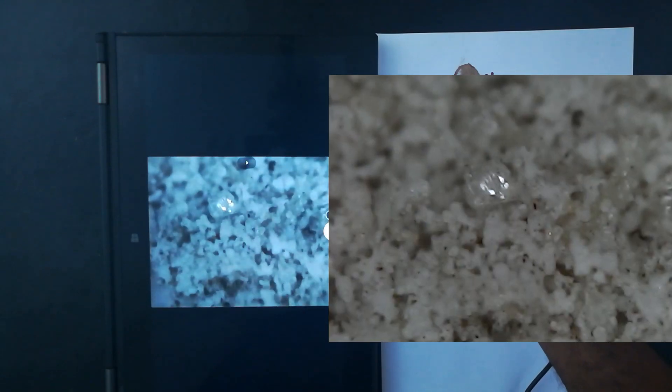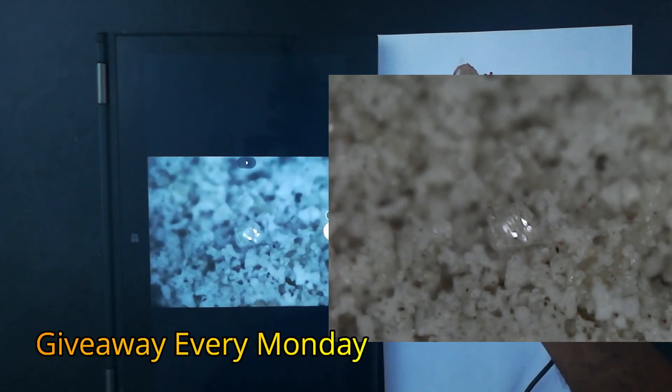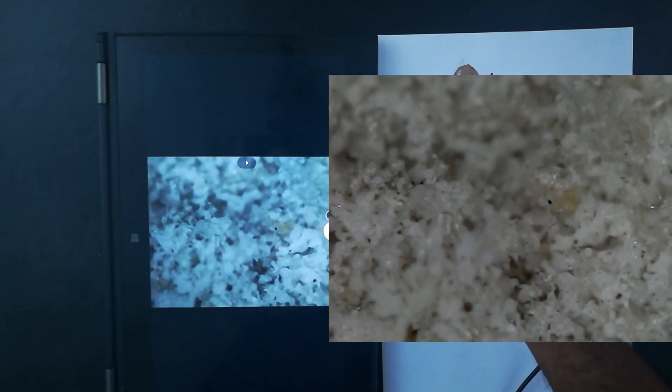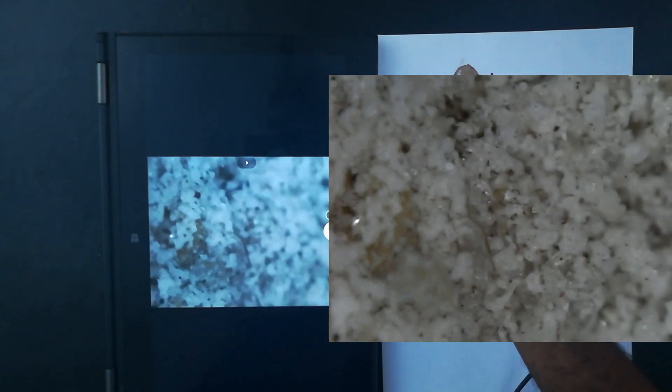These are, like you can see now on the screen, this thing is reflecting way too much light. It's some sort of a crystal. And the granules are much finer than the other two products that we just checked. What else we got? Okay, there's this different thing in here. See, the color of this thing is a bit yellowish. It's got so much different additives, man. I mean, this thing is full of additives.